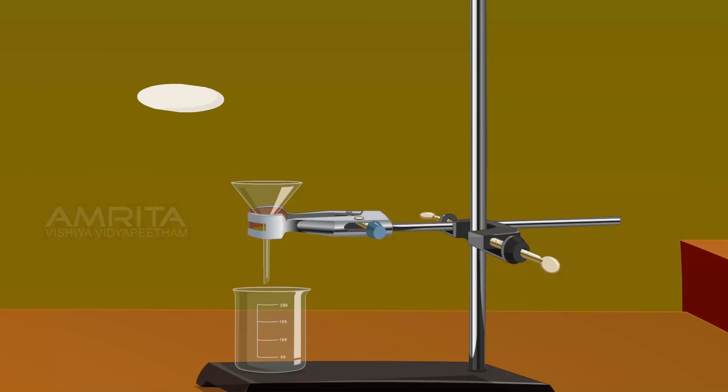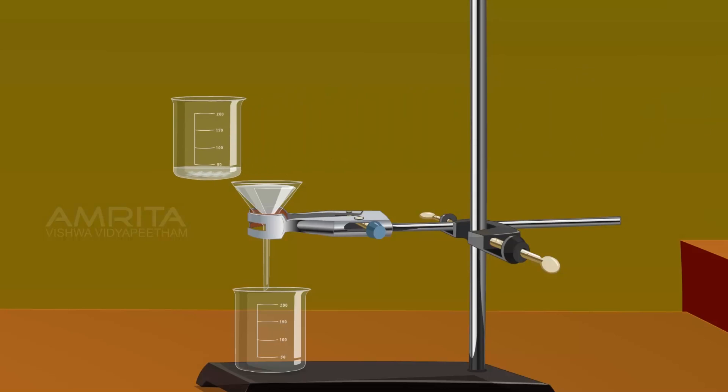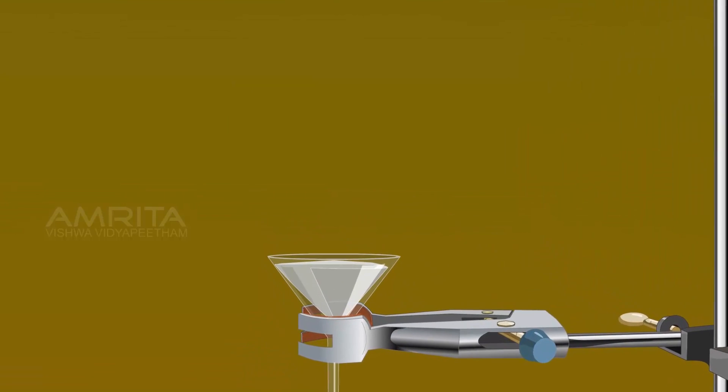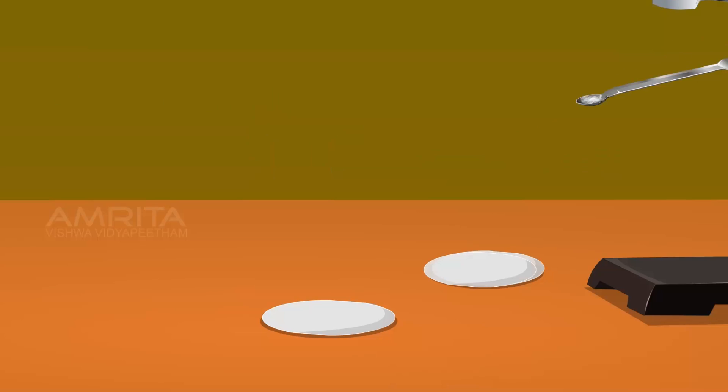Arrange the filter paper into the funnel for filtering the solution. Take the beaker from the freezing mixture and filter the crystals using the funnel. Colourless crystals of para-nitroacetanilide separate out. Wash the crystals with cold water. Using a spatula, transfer the crystals onto a filter paper and dry them by pressing them between filter papers.